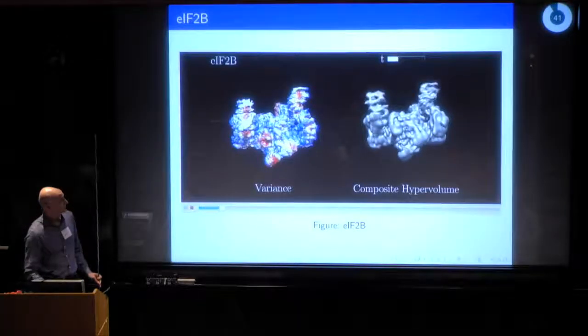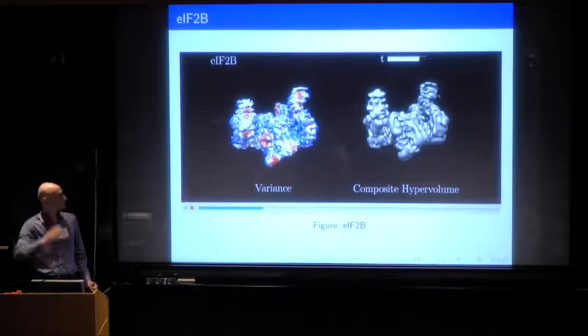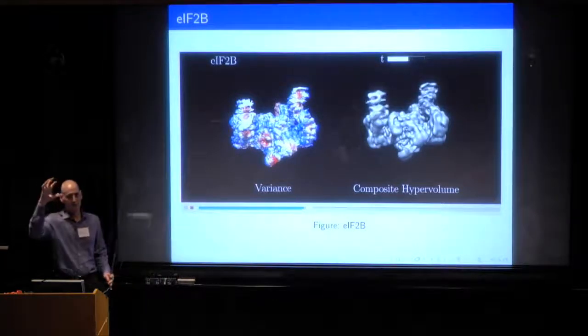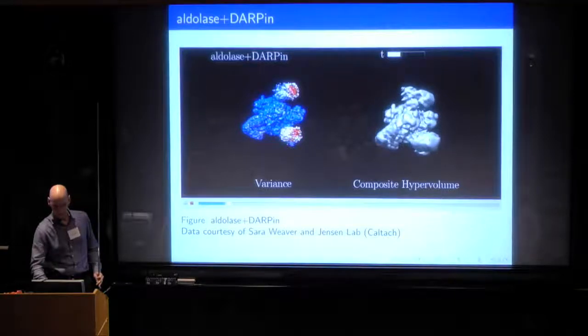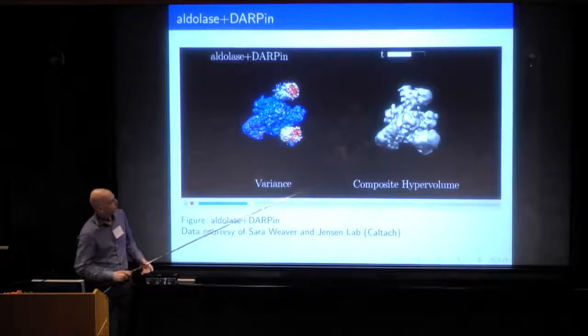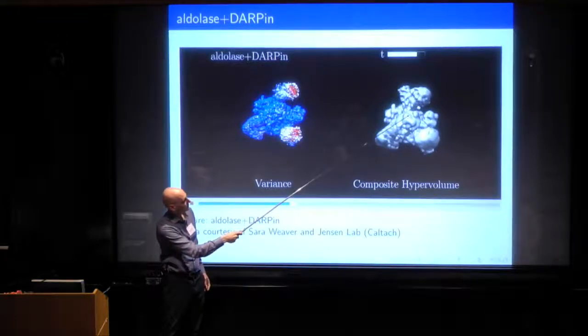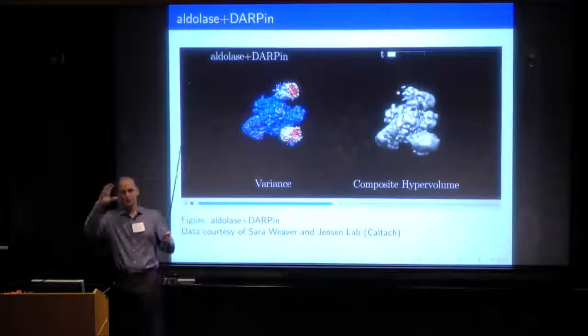So, other things. This is an actual molecule, and it's hard to see, but we think there's a kind of motion here where these things are spinning a little bit. And since we had this in the previous example, we think what we see here is these guys moving a little bit. You can see these two here. They're actually two independent objects.